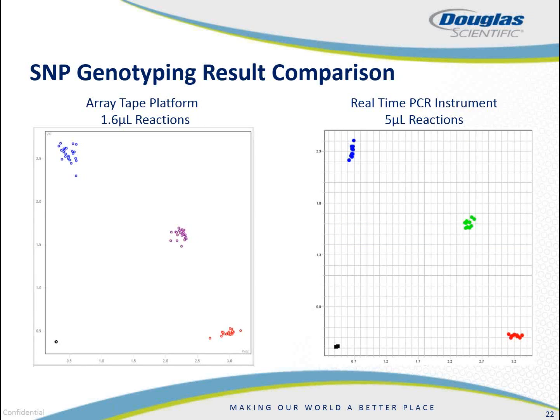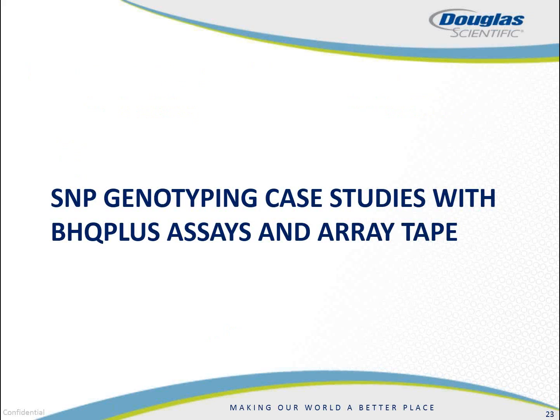So even though the instruments we just talked about are very different from what you might see in a standard laboratory setting with a real-time PCR instrument, the results are surprisingly similar. So here we have a picture of a cluster plot that was generated in the ArrayTape platform with 1.6 microliter reactions, and a matching set of samples and the same assay run in a real-time PCR instrument with 5 microliter reactions. And as you can see, the results are ultimately very much the same.